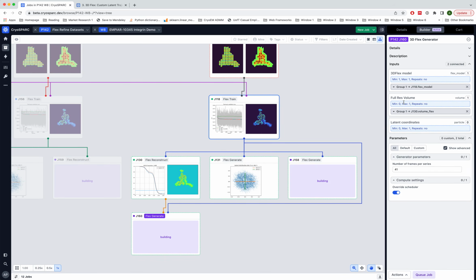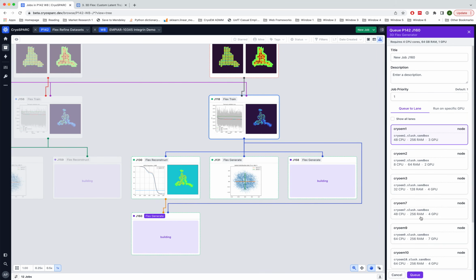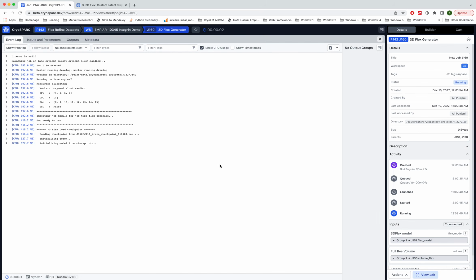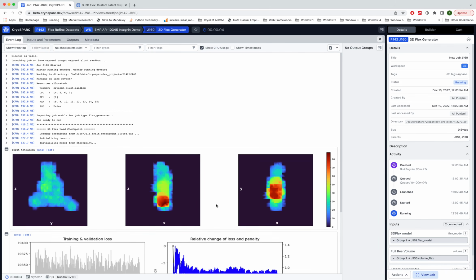The deformation model is upscaled to the new box size of the high resolution density, but this job will allow you to visualize the same bending and deformation motions, this time with a high-res model. This is great for making nice videos and perhaps for publication figures or anything like that. I've run this job now, and it'll run and generate some outputs for us, which I can then download and we can take a look at.